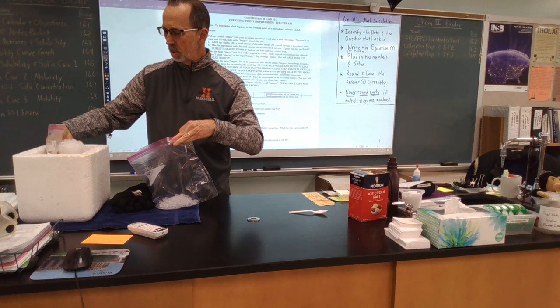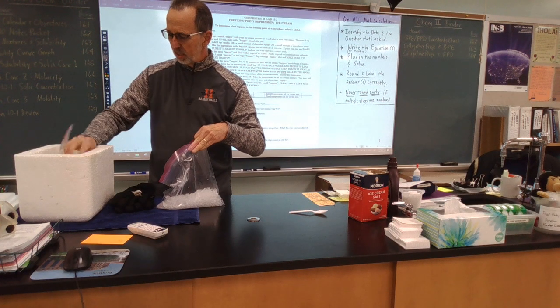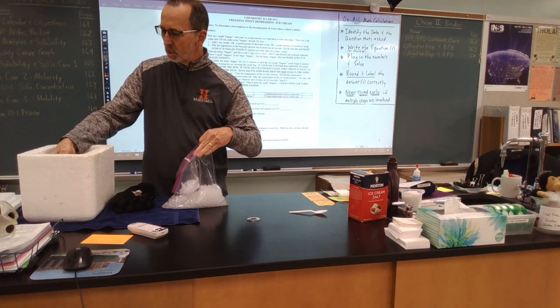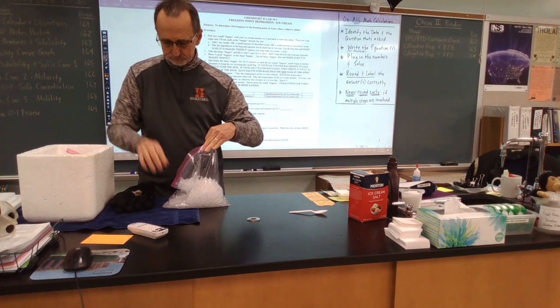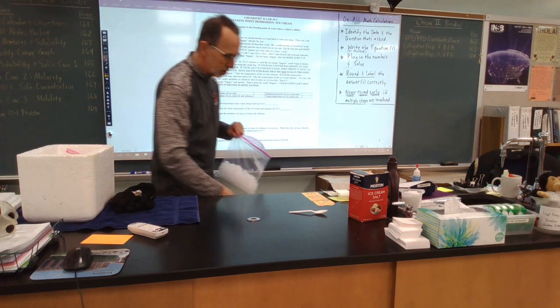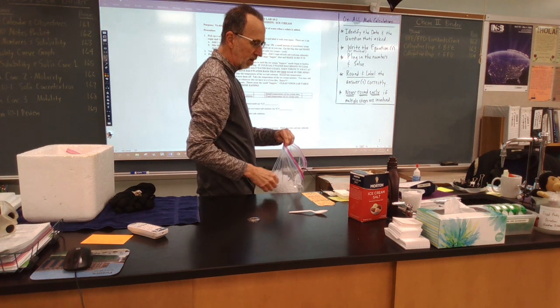There's 1, 2, 3, 4, and 5. Like so. Let's take the temperature of that real quick. That's something we got to record. I'm assuming it's close to 0.